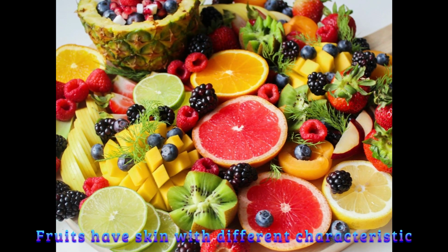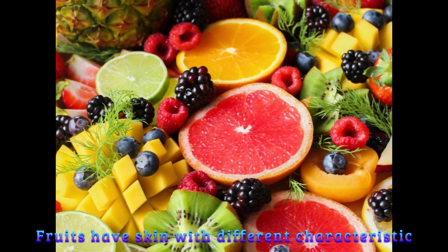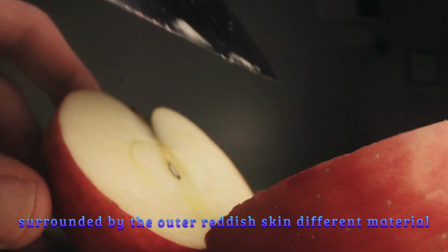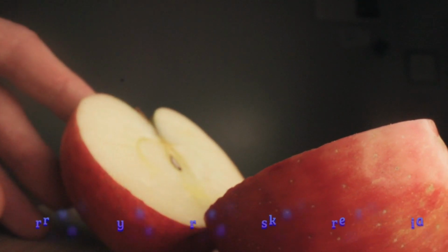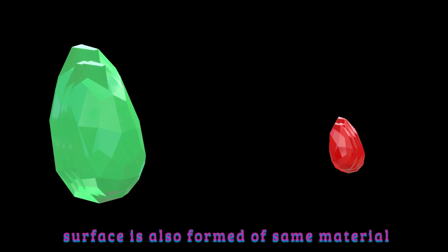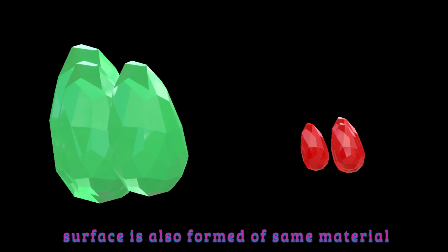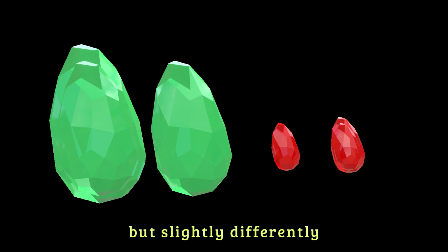Let's consider fruits. All fruits have skin with characteristics different from their cores to protect them. An apple has a uniform core of white pulp surrounded by the outer reddish skin of a different material. The surfaces of crystals are also slightly different from their cores. As crystals have only one material, their surface is also formed of the same material but slightly different.